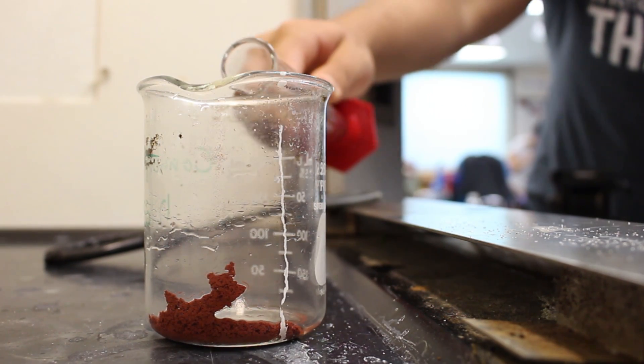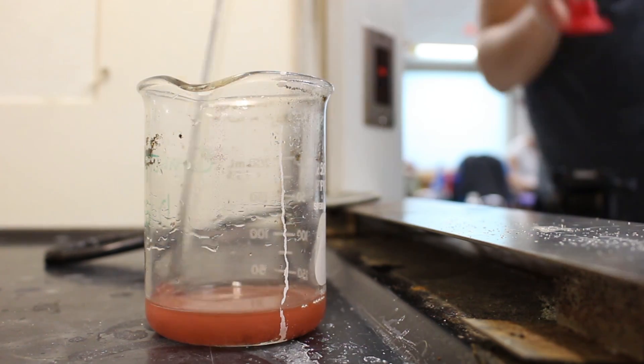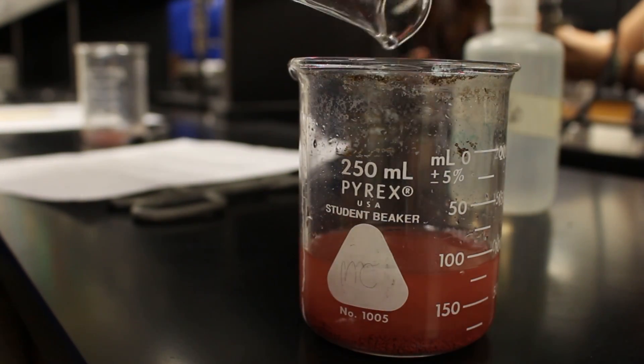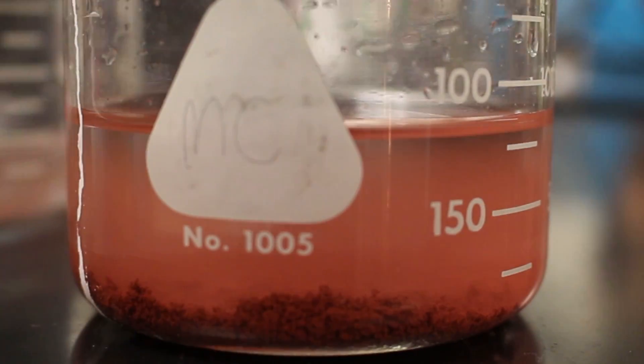Next we added 20 milliliters of 6 molar hydrochloric acid to remove any remaining zinc. We washed and decanted our copper several times to remove all supernatant solution.